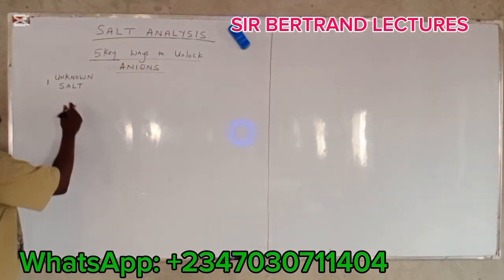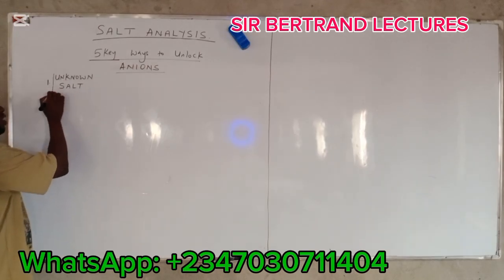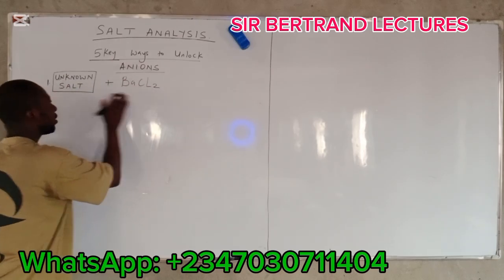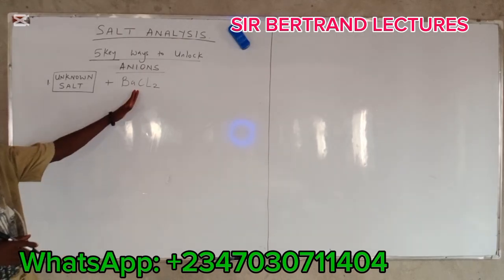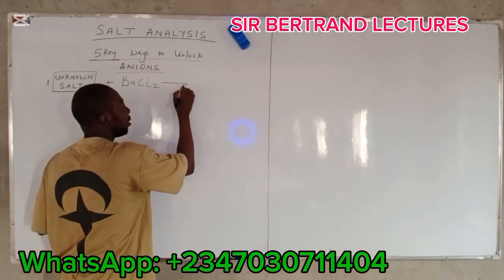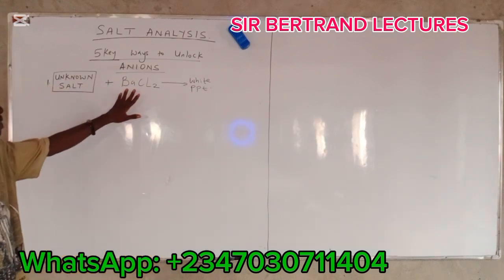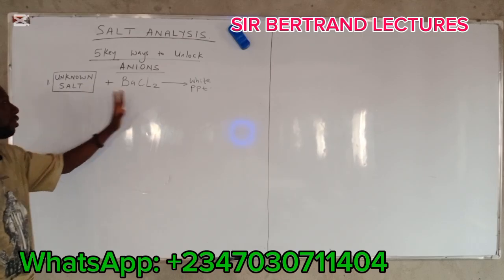So let's proceed. To an unknown salt sample, here is the unknown salt sample, you add barium chloride to that unknown salt sample. Then, if the salt gives white precipitate after you have added the barium chloride, the salt gives what?